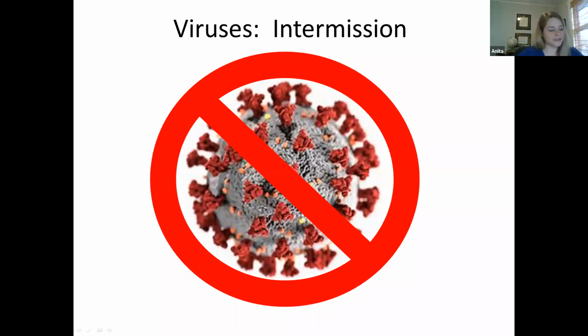I definitely took a lot of time talking about things I wish I had known about viruses when I first started using them, and not as much time on the actual tracing that you do with viruses. But of course, Luke and Tiago have talked about fluorophores, GFP, mCherry, GCaMP. So you guys have heard about those kinds of things. And if there are specific viruses you want, I only had time to go over in depth a couple of them. So if there are ones that you want me to go in more depth on, just email me and let me know.